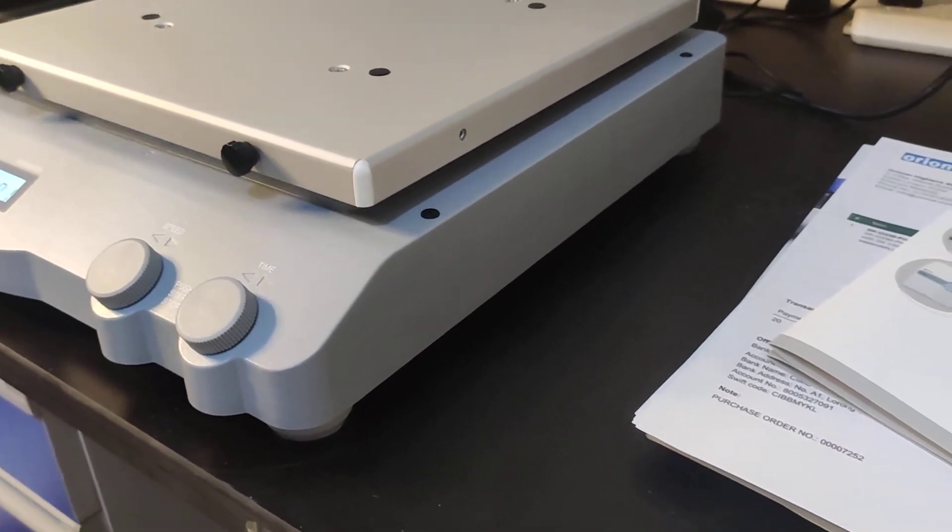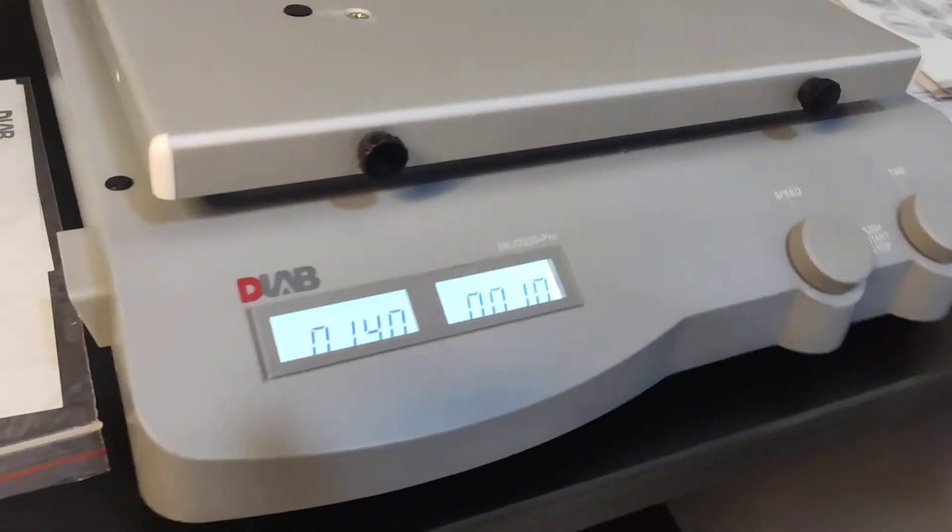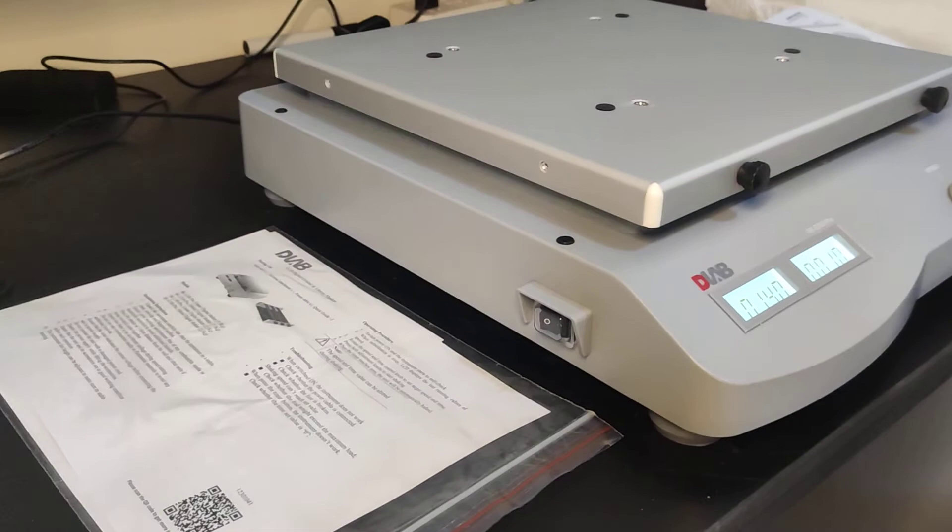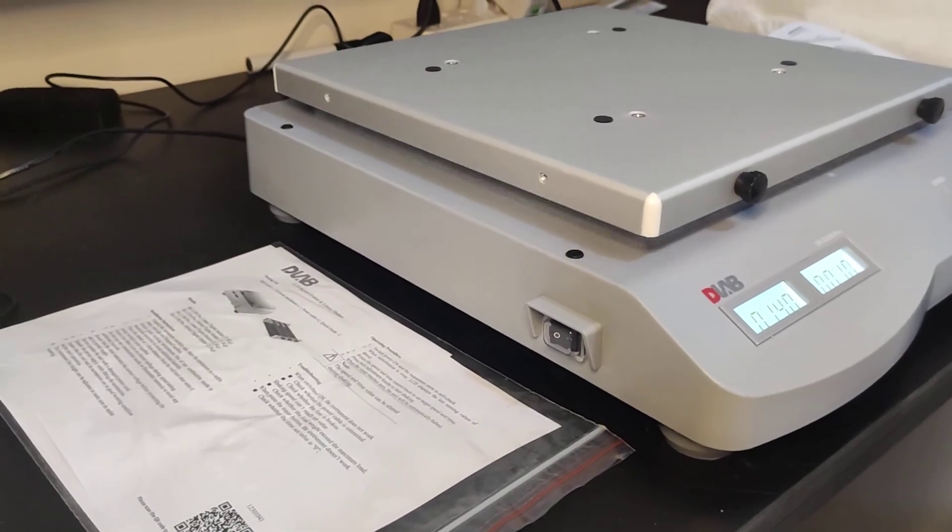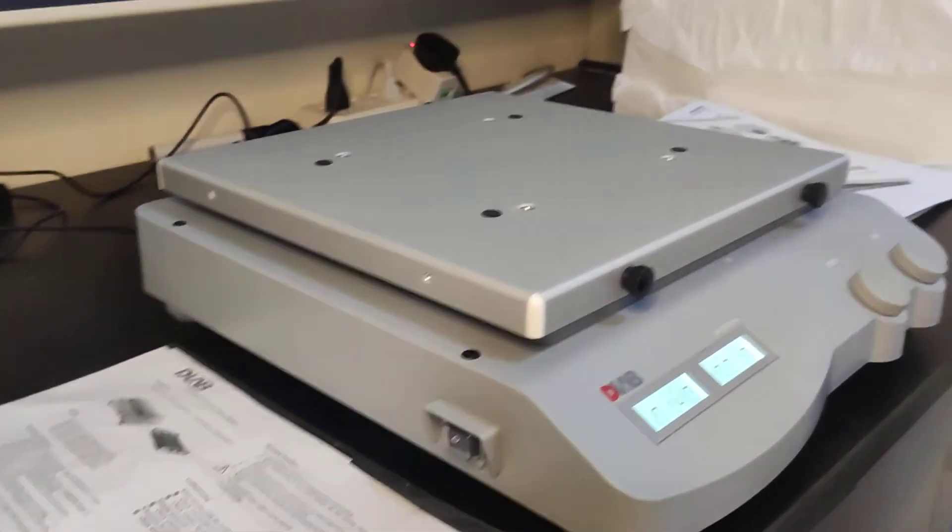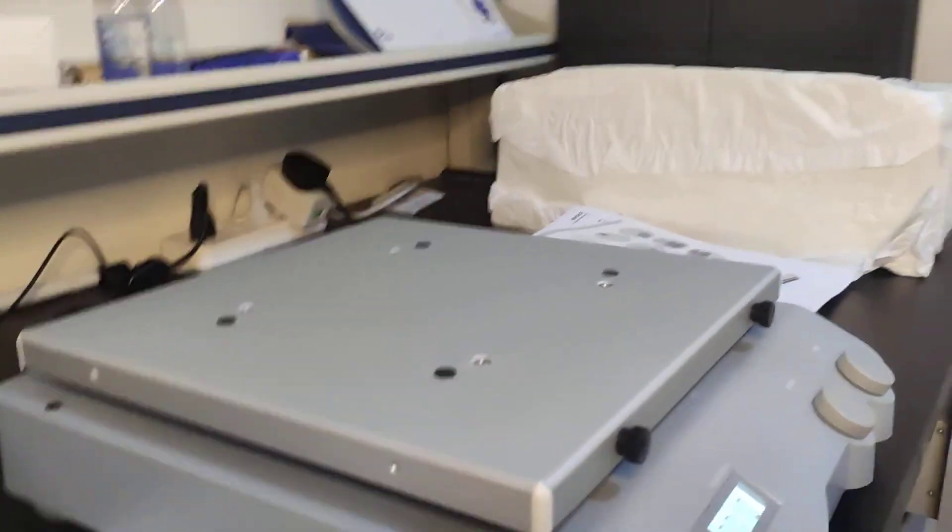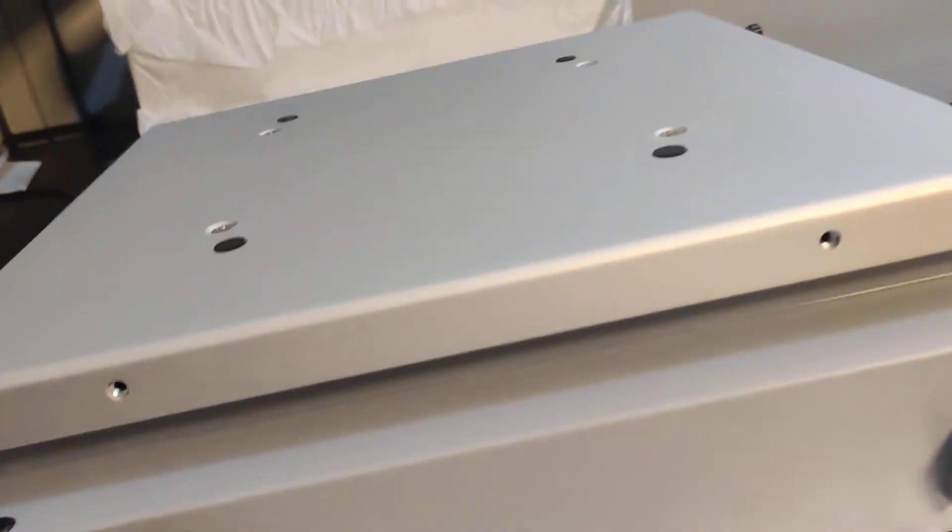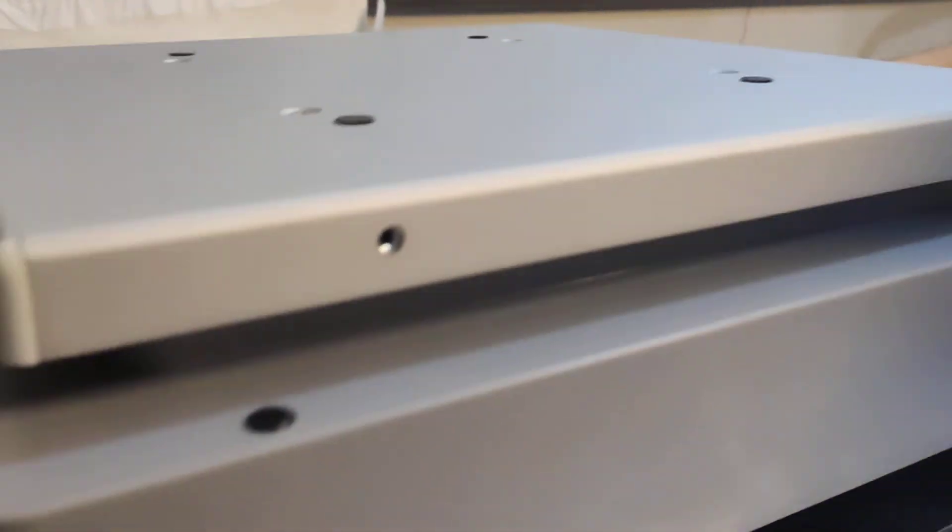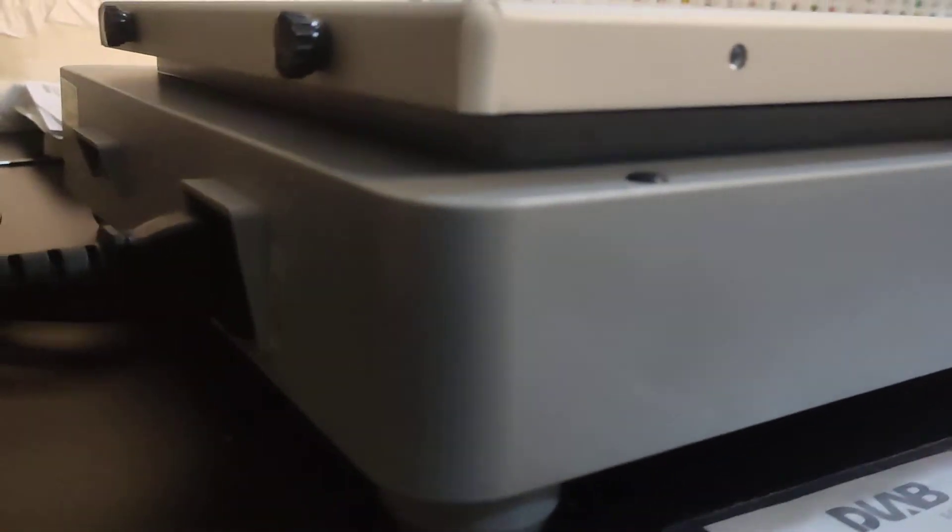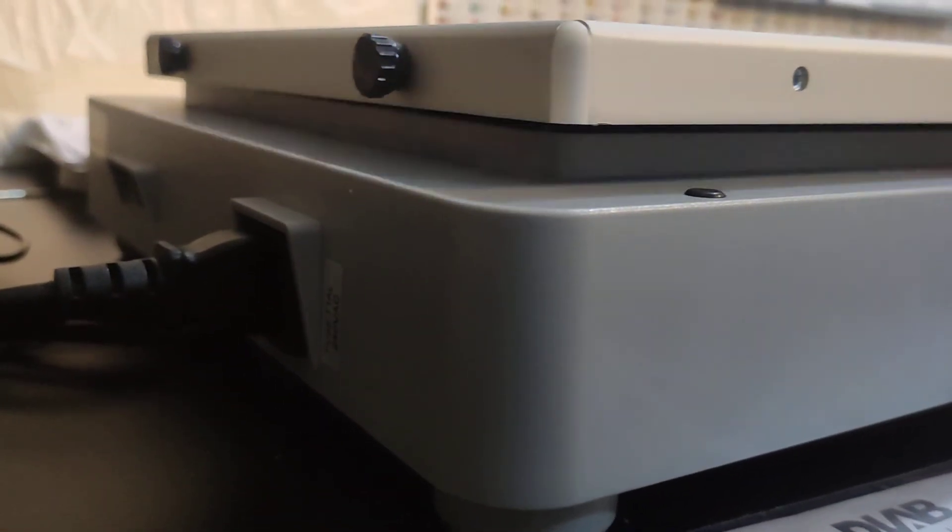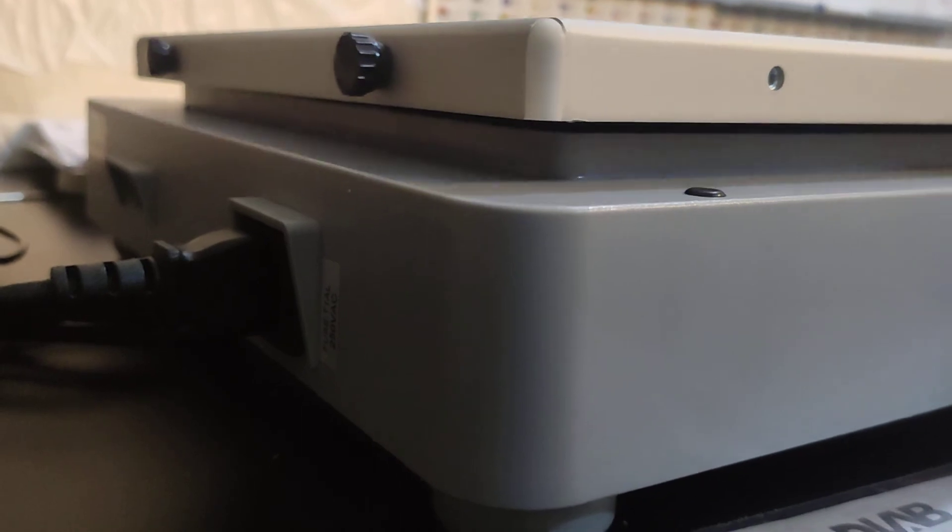This from the right side. Here from the left side. And we also can check the back side. Back side only the power cable.